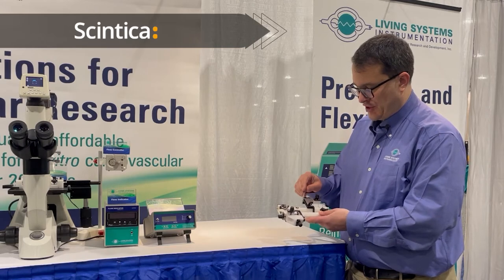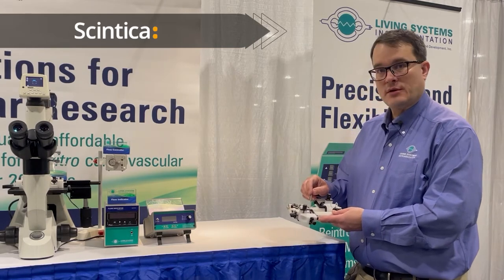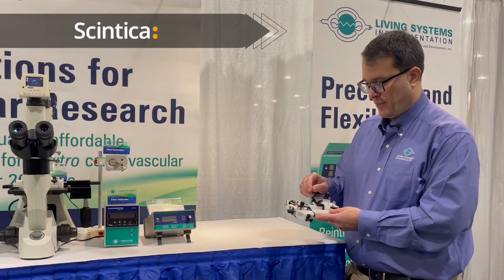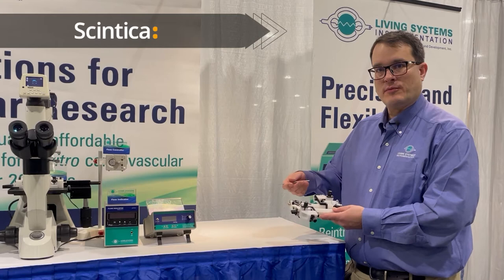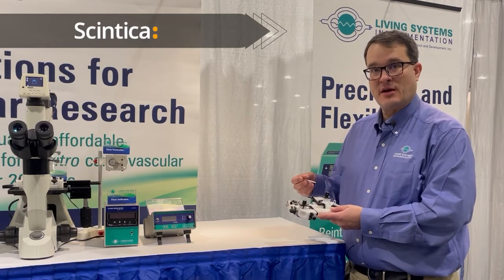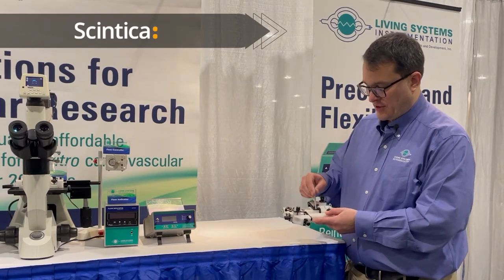The way we do that in this chamber is using stainless steel luer hypodermic tubes and those stainless steel hypodermic tubes can be ordered in different sizes depending on the size of the specimen that you're studying.